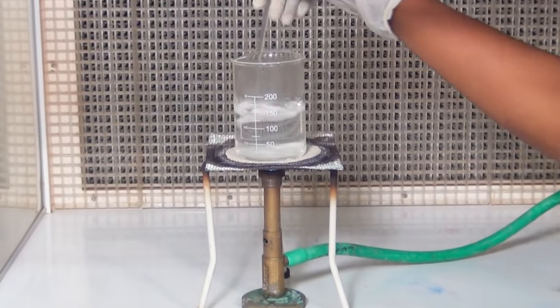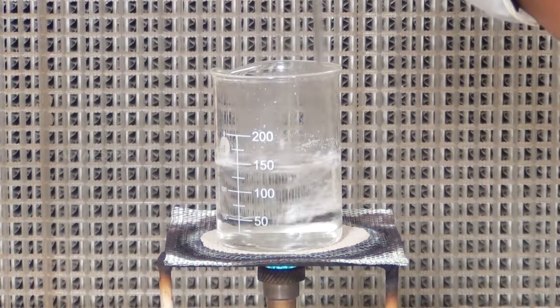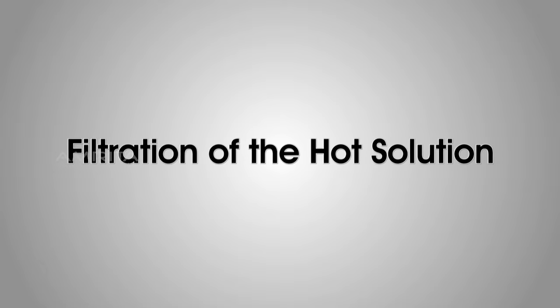If required, heating can be done to dissolve benzoic acid. Filtration of the hot solution.